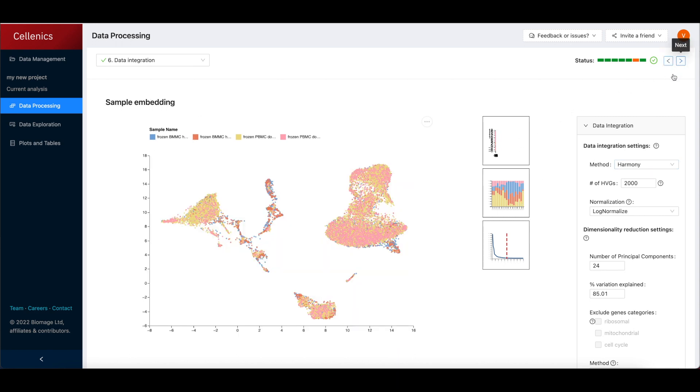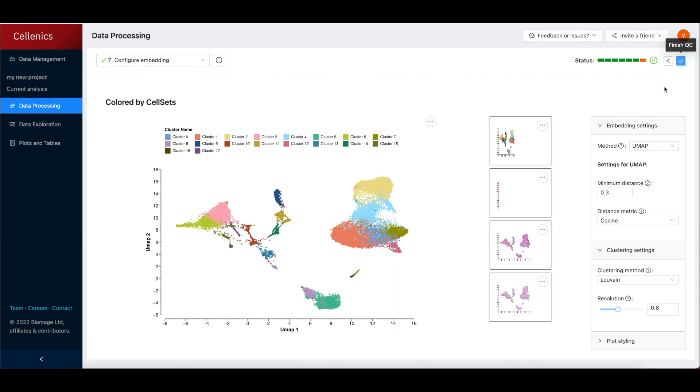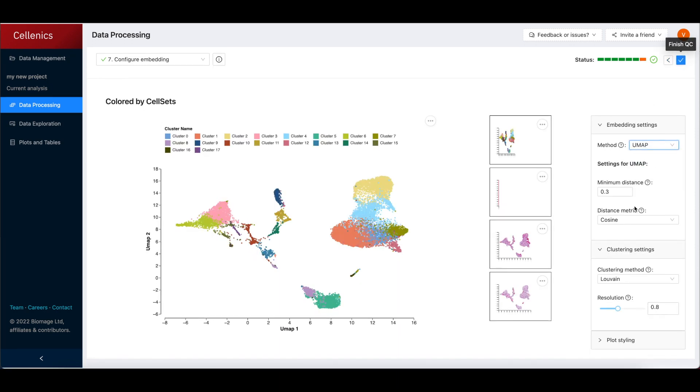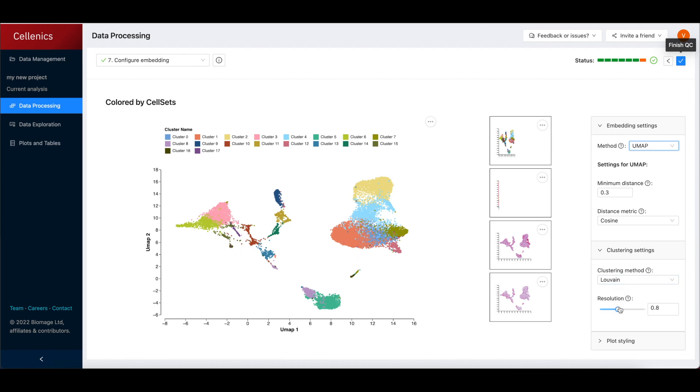Finally, in step 7, the embedding is configured as UMAP or t-SNE and the clustering algorithm and resolution is customized.